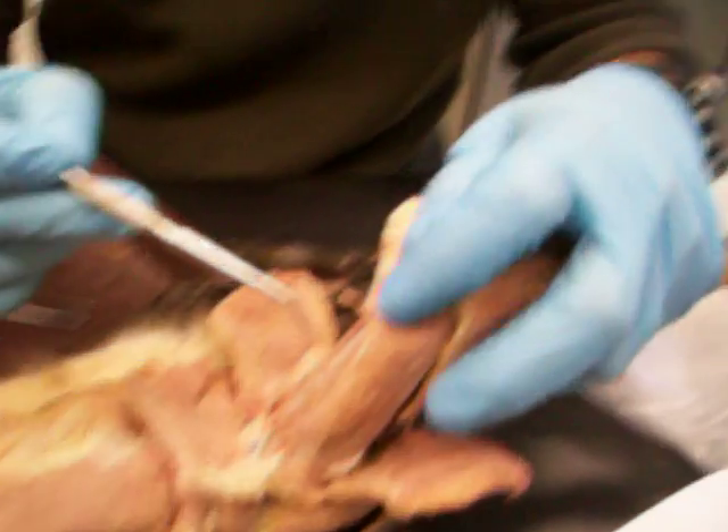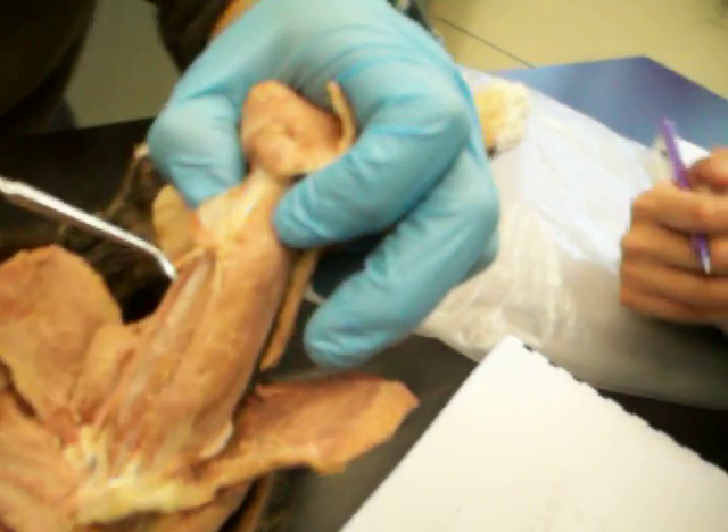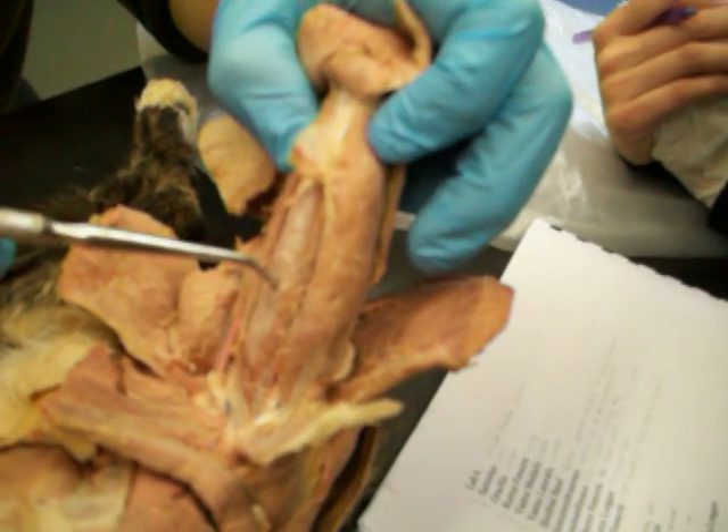Moving that all the way, you can see the quads — three to four quad muscles: vastus lateralis, vastus medialis, and rectus femoris.